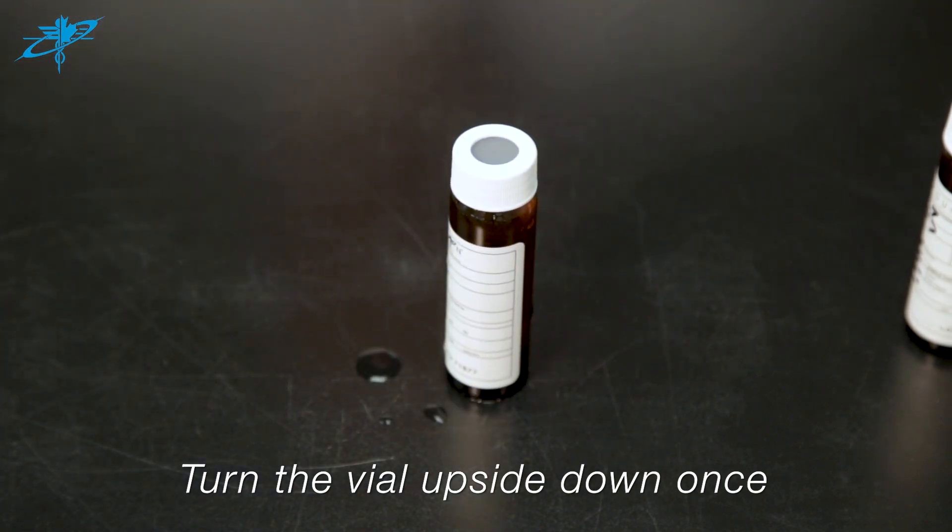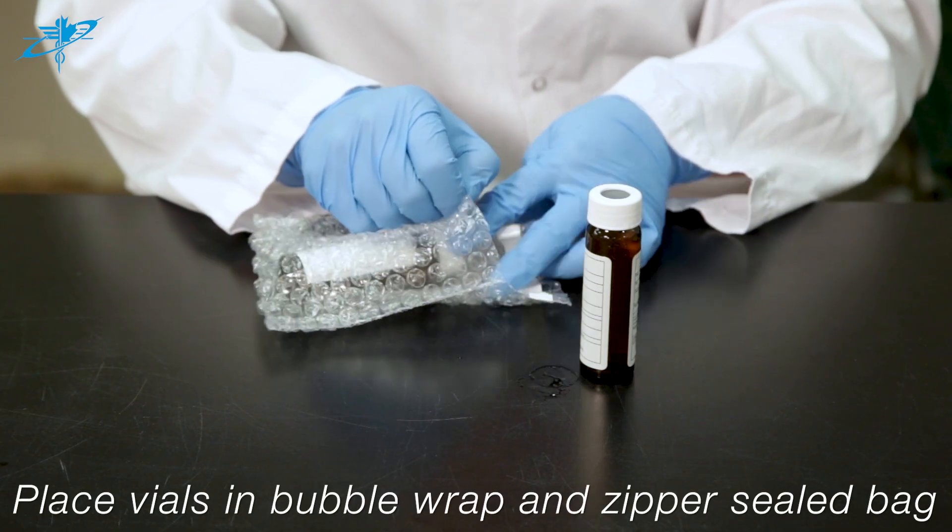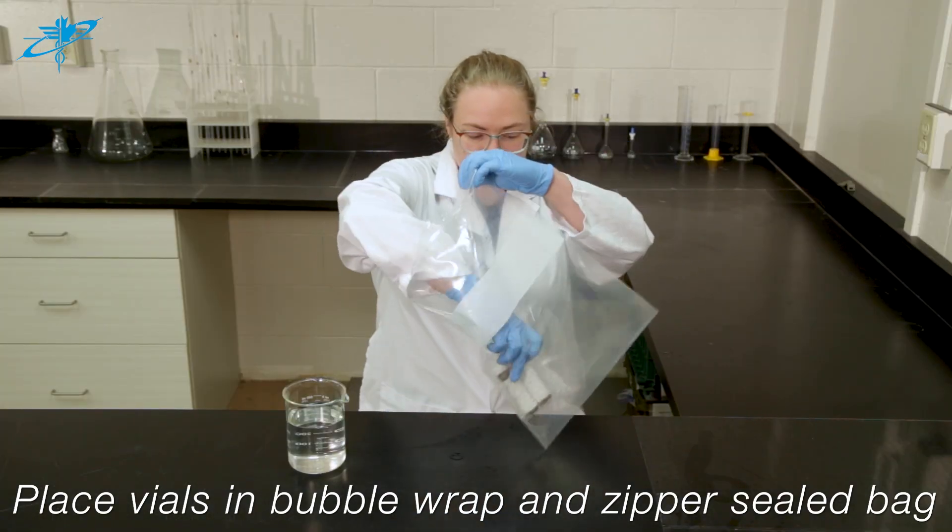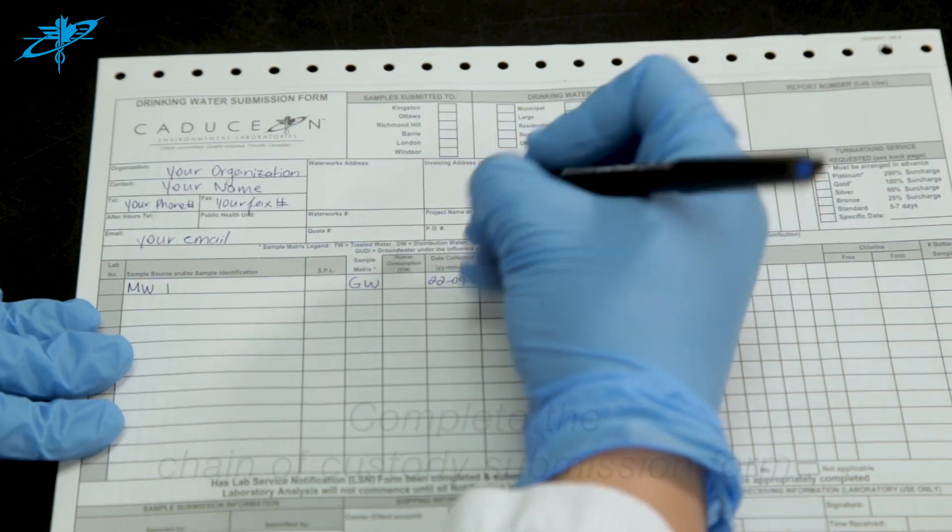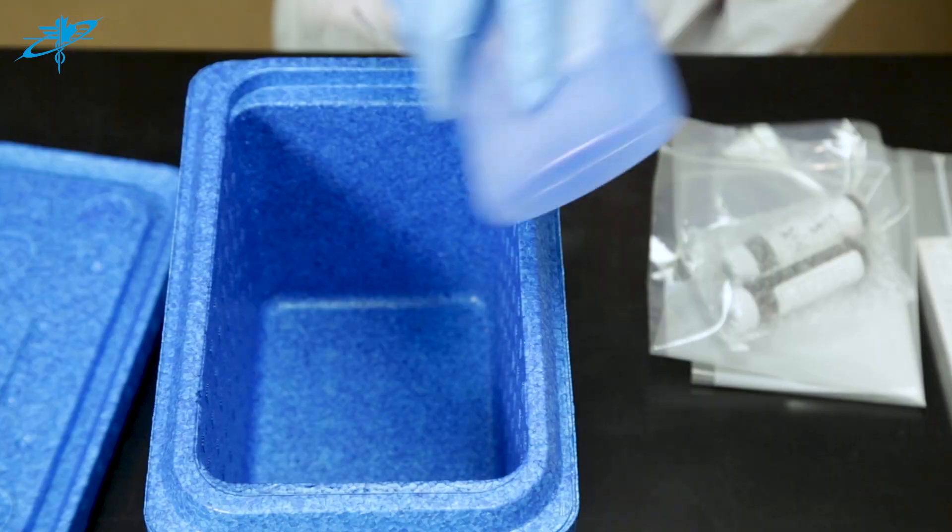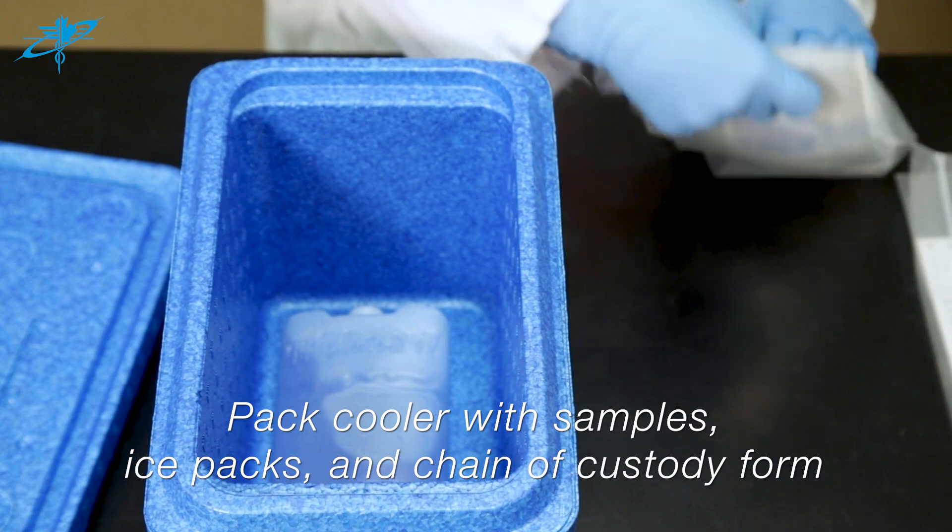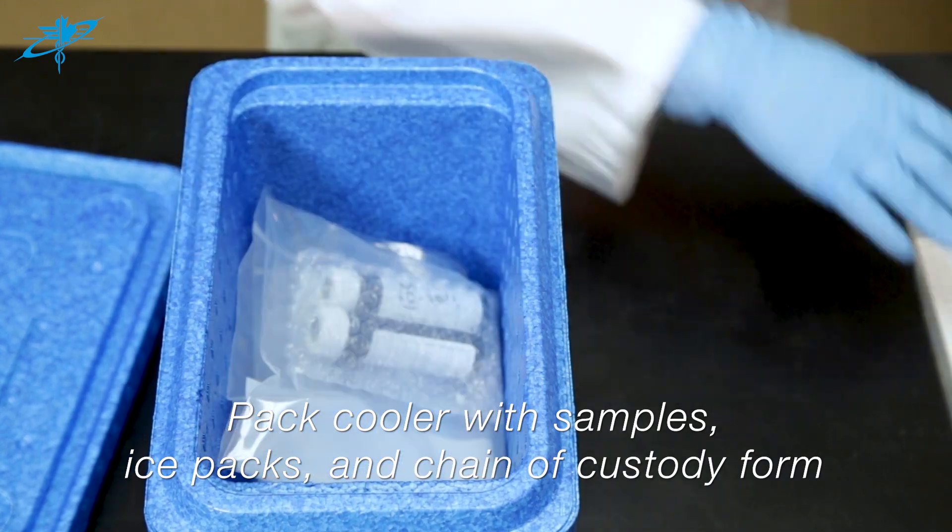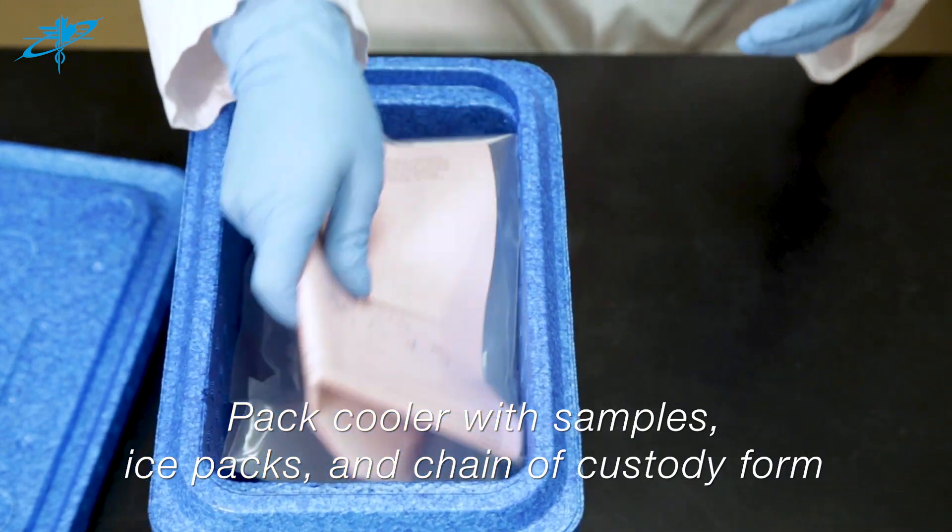Place the vials into a bubble wrap bag and then into a zipper seal bag. Complete the chain of custody submission form in its entirety. Place the sample into a cooler with ice packs. Include your chain of custody submission form with your sample for transportation to the lab.